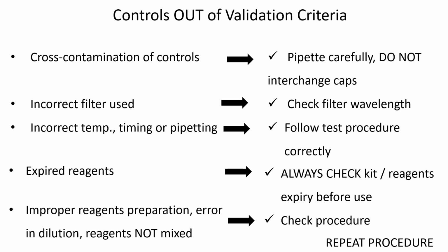Expiry: always check the kit before the expiry and use that kit. Then improper reagent preparation, error in dilution, reagent not mixed: so check the procedure properly. If all this is happening, then we have to repeat the procedure.